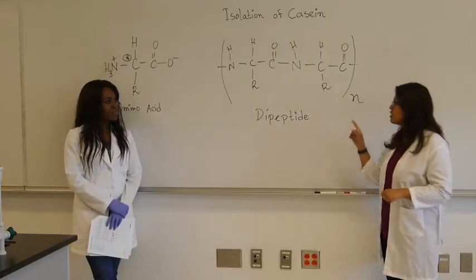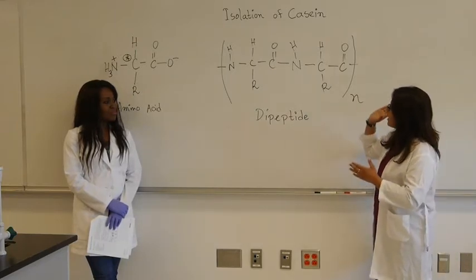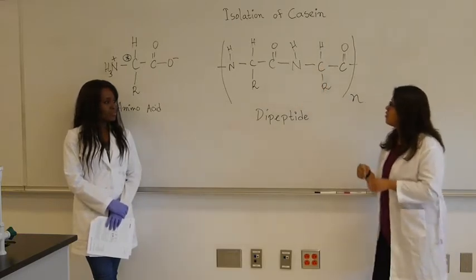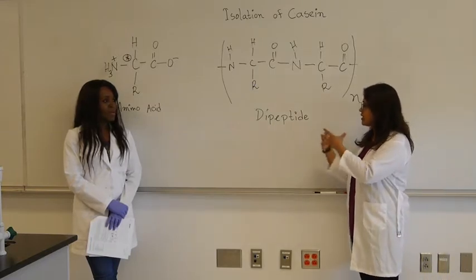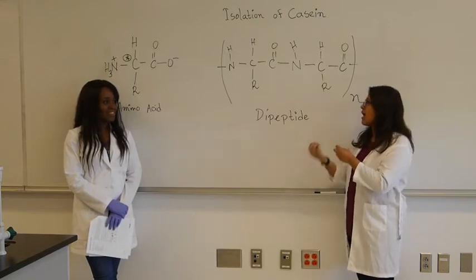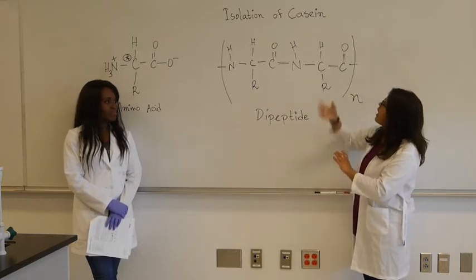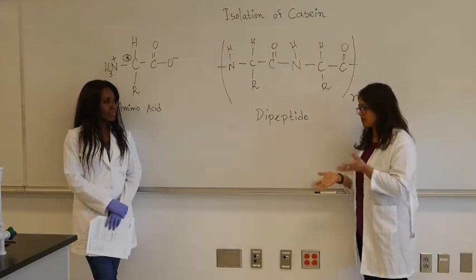How do we do that? A protein gets denatured if you add acid to it. So the bonds break; the protein exists as a micelle, and the micelle will break down, the bubble will pop, and the solid part will settle down at the bottom. So that's how we can isolate the casein from the milk. That's all about the lab, essentially.